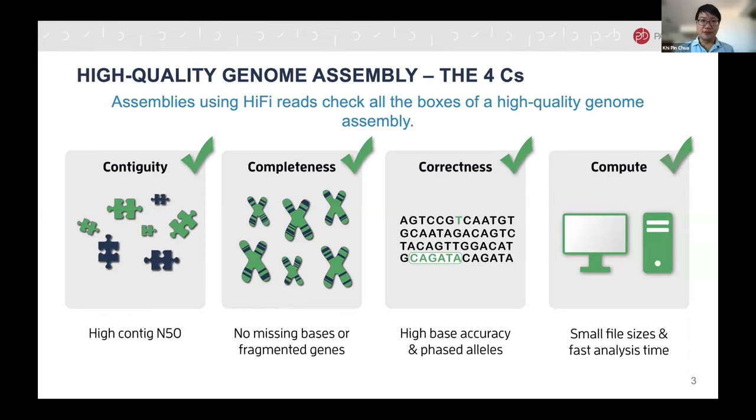Think about the possibility of this, where you can quickly generate genomes. And perhaps if you have any issue, you can optimize it and regenerate it all within the span of hours. And in large projects, this allows you to focus on the downstream biology that's important to study instead of spending time waiting for the genome assembly to finish.